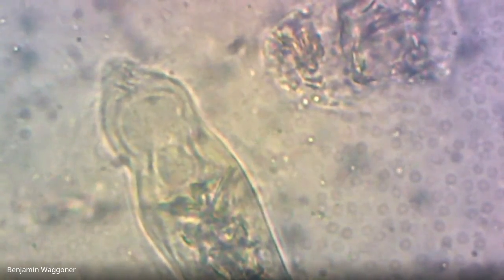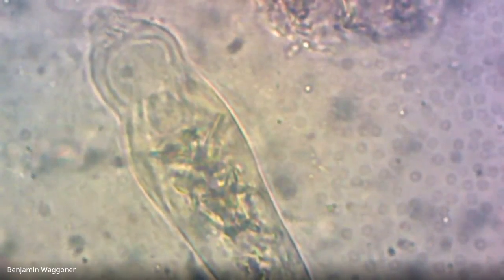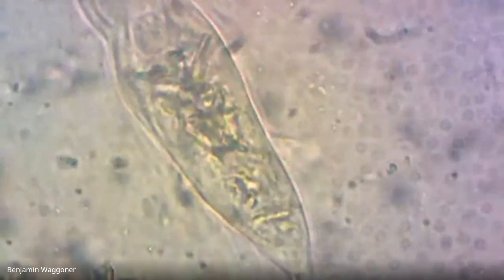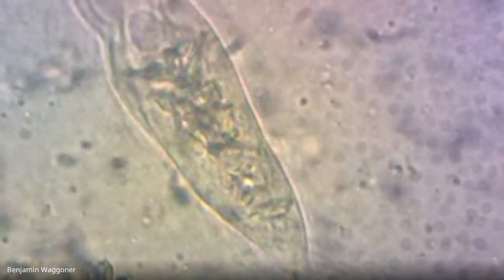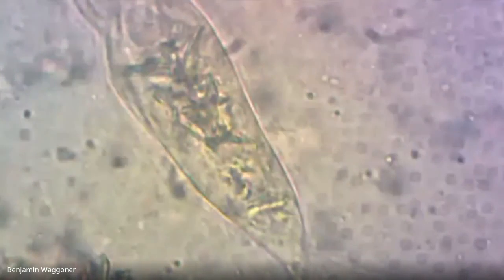And then about midway down, we have a nucleus. I've centered on the nucleus right now. And then back of the nucleus, the body is, you can see there's kind of hardened looking things in the back of that body. Those are actually wood fragments. This is either genus Trichonympha or close enough that I'm not counting. There's a lot of obscure genera in here, so I don't know that a specialist in termite symbionts would call this Trichonympha, but it's close enough.